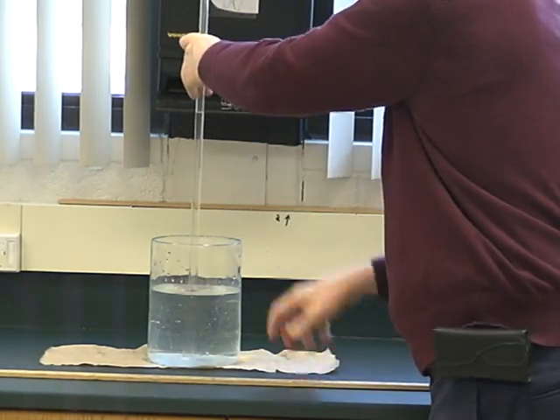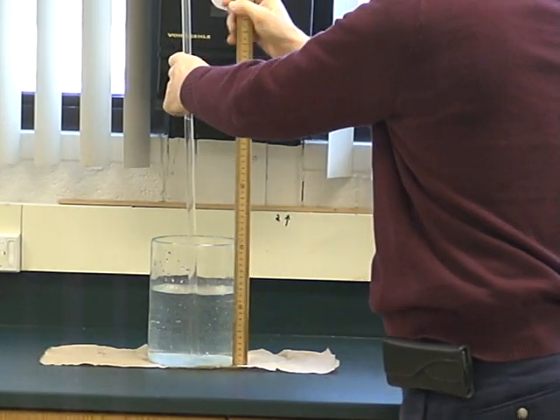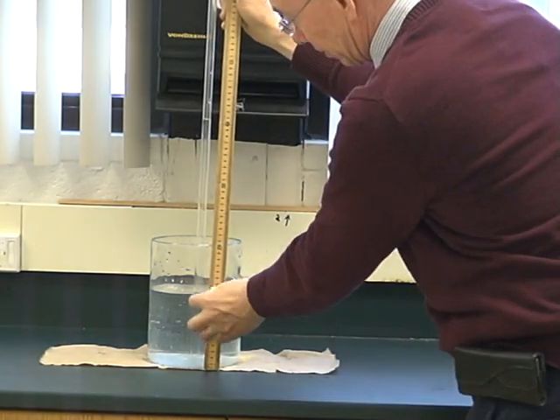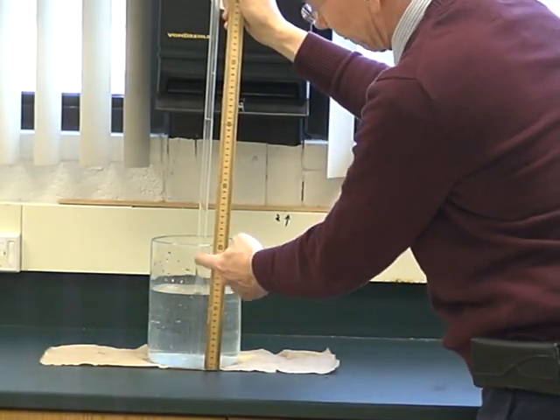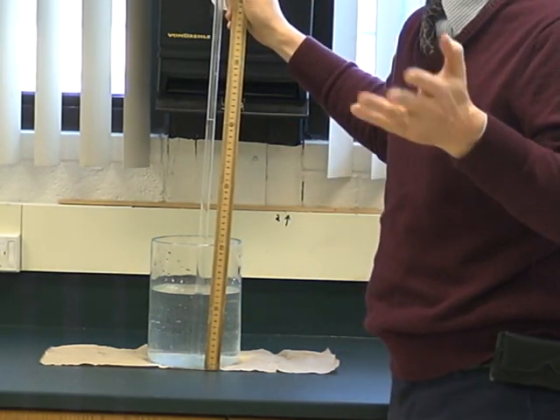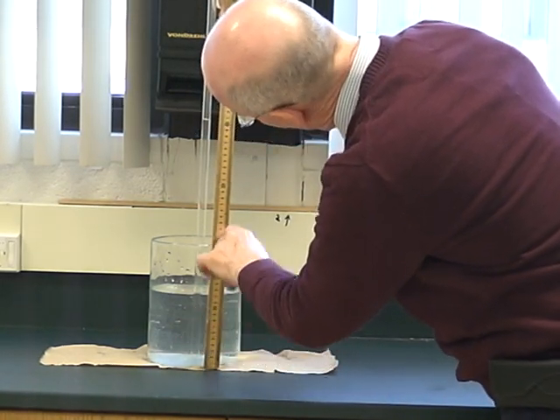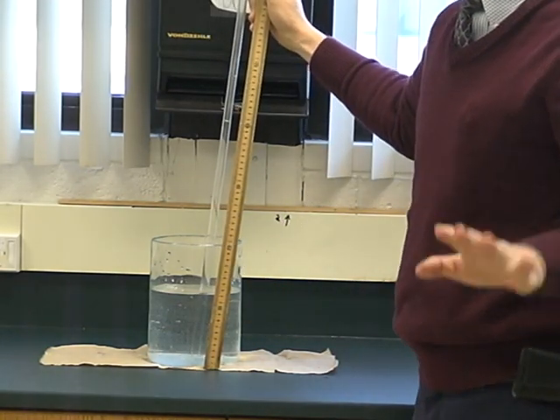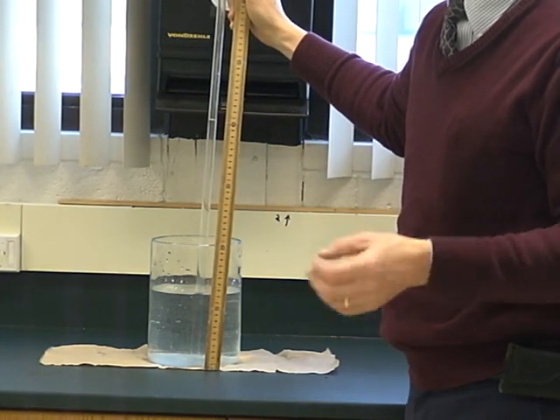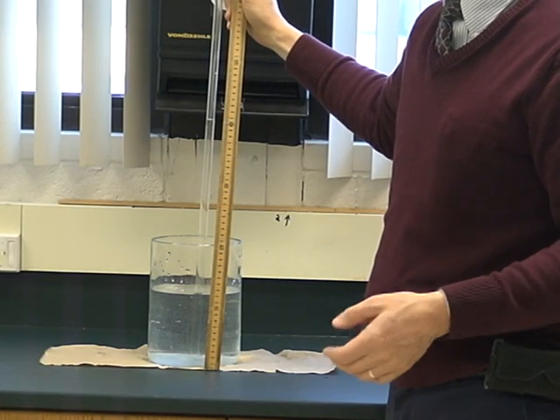If I find the difference by simply measuring here, I can measure the difference between the water level where atmospheric pressure is pushing and the water level inside this tube. I want to do it in millimeters because eventually it's millimeters of mercury that I want. So here it's 12 and it goes up to 42, so 42 minus 12 is 30 centimeters, but I need to change that to millimeters — so it's 300 millimeters of water.